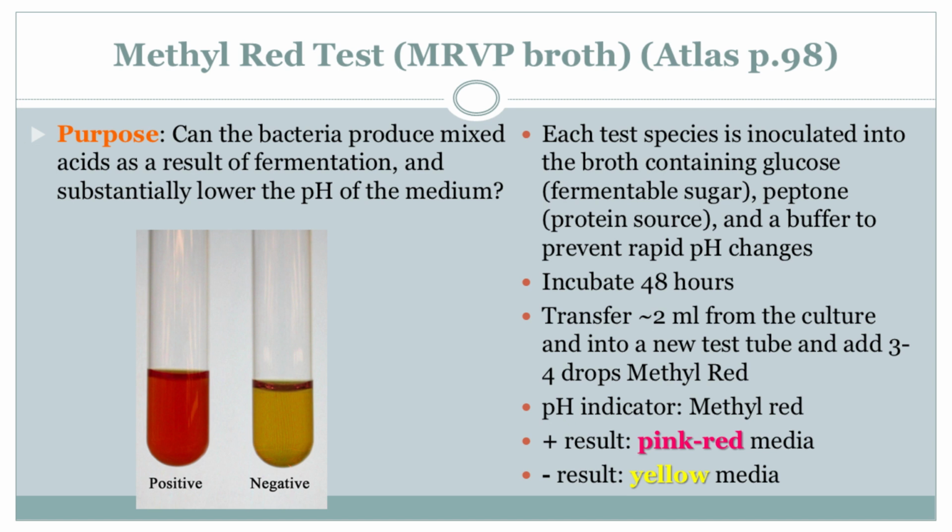The methyl red acts as a pH indicator. Like a detective, it tells us whether those bacteria have been busy making the broth more acidic. Okay, so if the bacteria are producing acid, what do we see? What does the methyl red tell us?